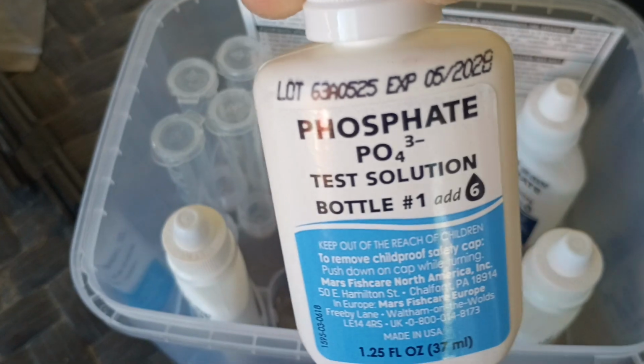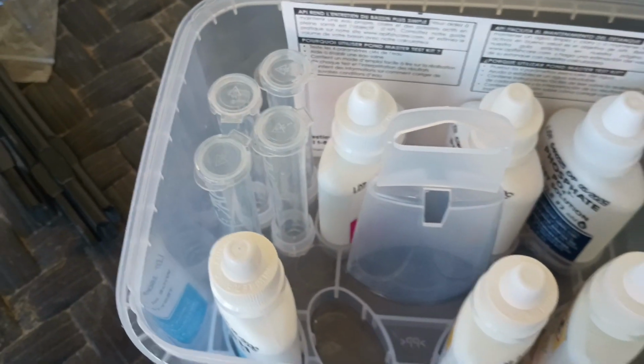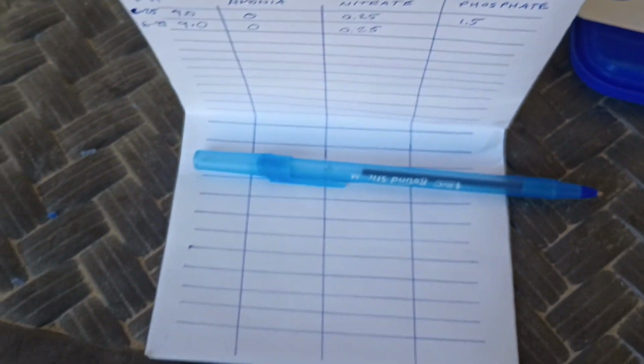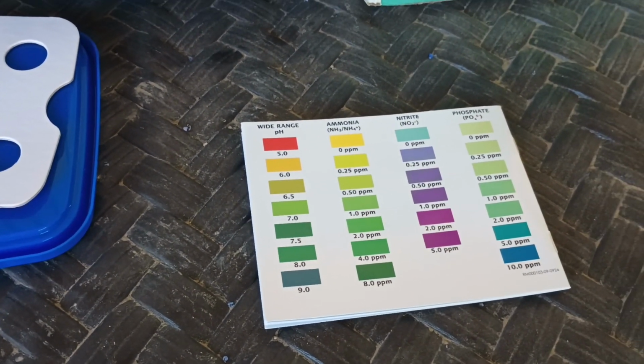But yeah, there's a kit. Each little bottle tells you exactly how to test it, how many drops, and you can read the instructions. But I figured I might as well go ahead and get one and test it so I can see how the fish are doing. So that's that.